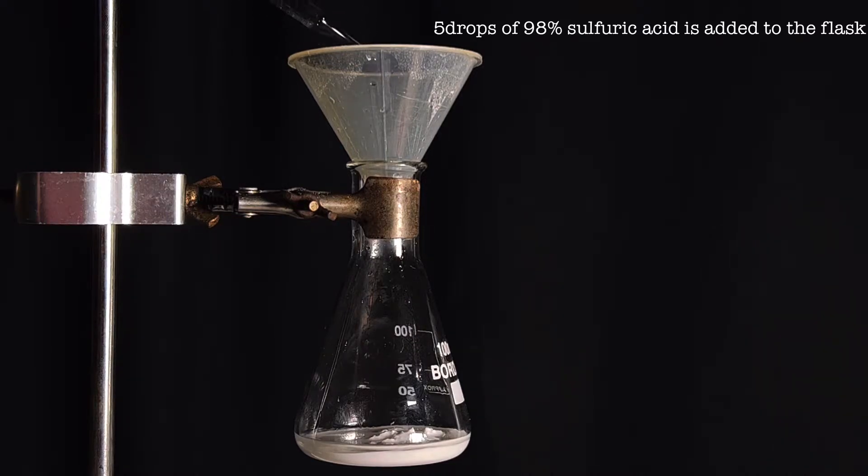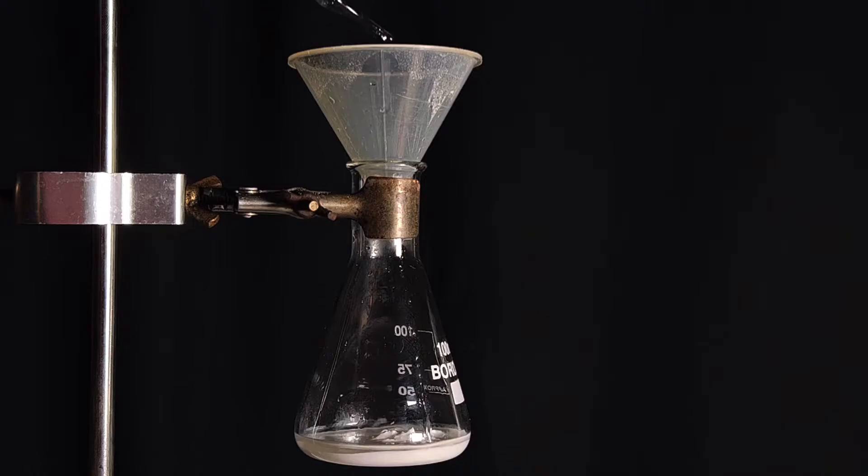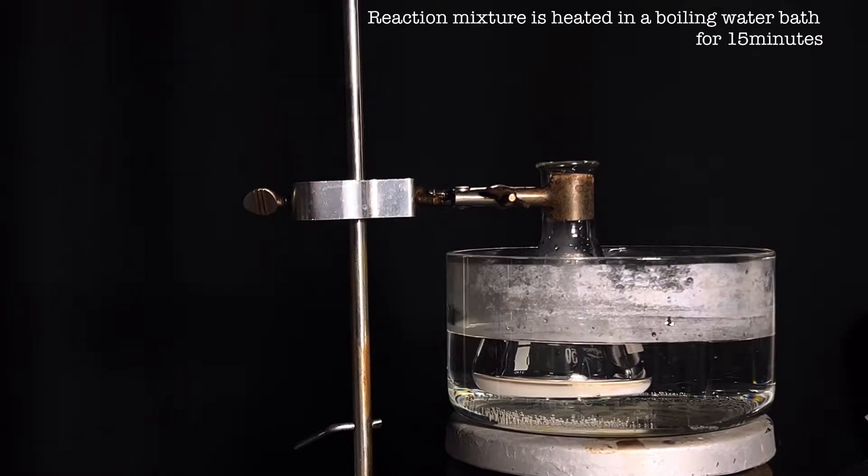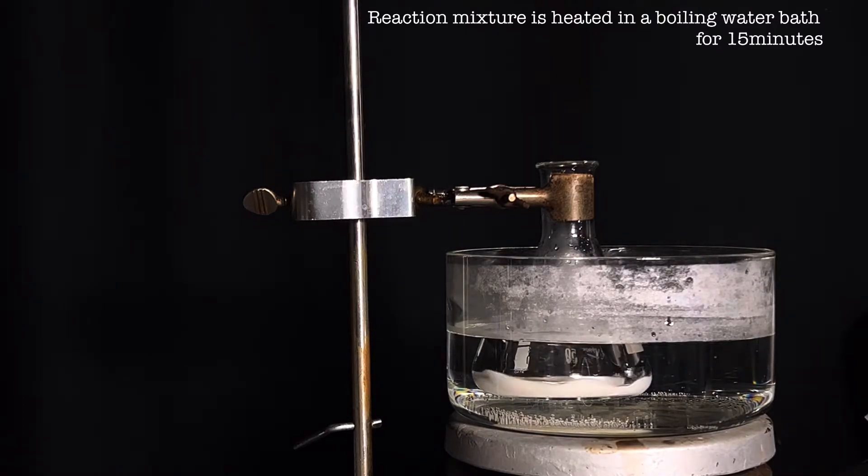The Erlenmeyer flask was then immersed in a boiling water bath and stirring was turned on. Within a minute all the solid present in the reaction mixture will dissolve and a clear solution is obtained.